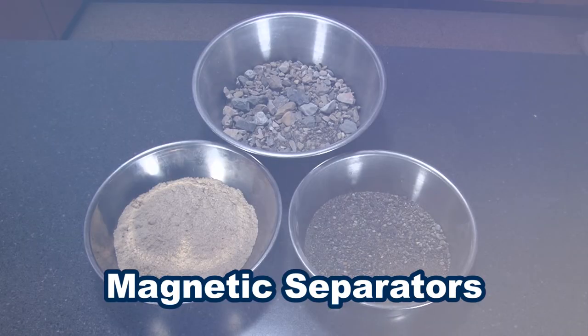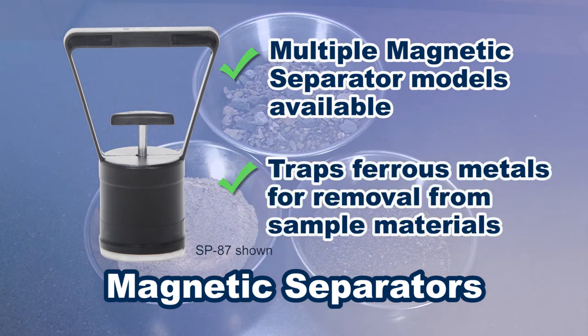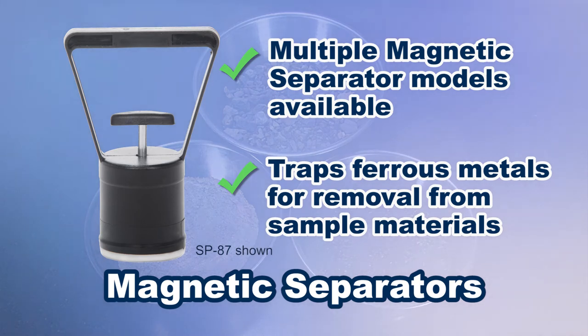Magnet separators quickly trap ferrous metals from sample materials to avoid sample contamination, prevent incorrect results, or to protect lab instruments from possible damage.